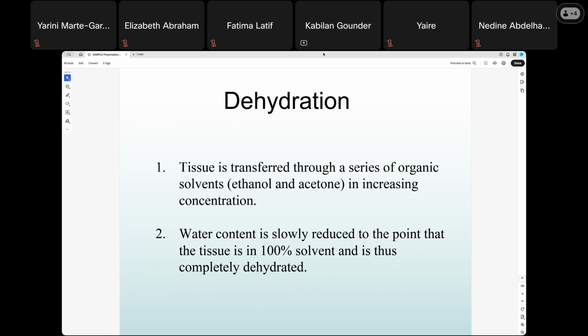We should not dehydrate. That's why they immediately put in an IV and give saline, that is phosphate buffered saline, PBS. So here we now know the importance of hydration. If you remove the water content, you will affect things. But here, we intentionally remove the water content from the samples.